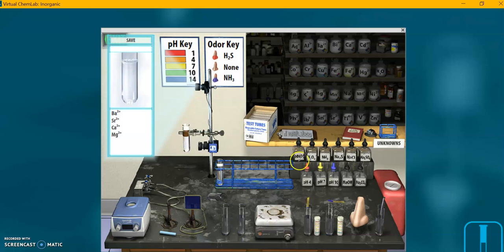Now, I'm going to add some sodium sulfate. Click there and check it out over here. Now we see it turns white, definitely looks like a precipitate. And if you look here at the list of chemicals, we see that we have a precipitate barium sulfate.